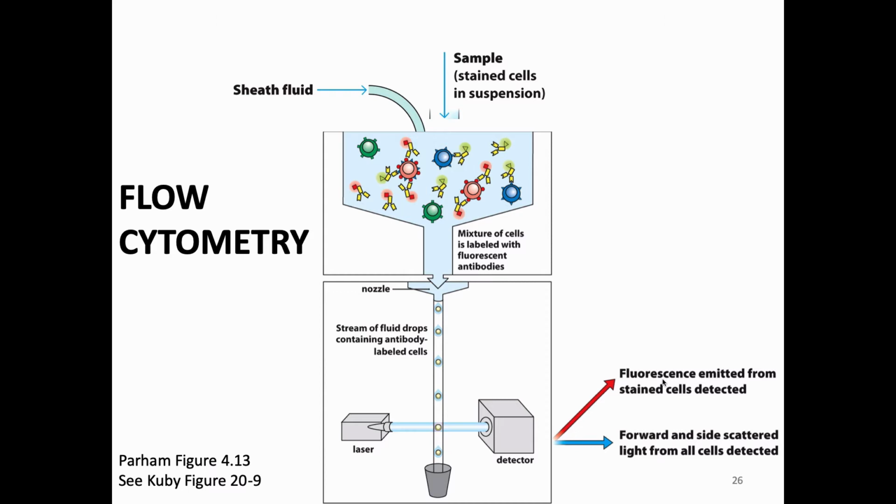I'm guessing your question is how you make sure, and there are some quality control things that we can talk about later. So we are basically going to have droplets with 1 cell per droplet coming out of this machine, falling. And they are then going to be hit by a laser. The laser is going to see a few different things.